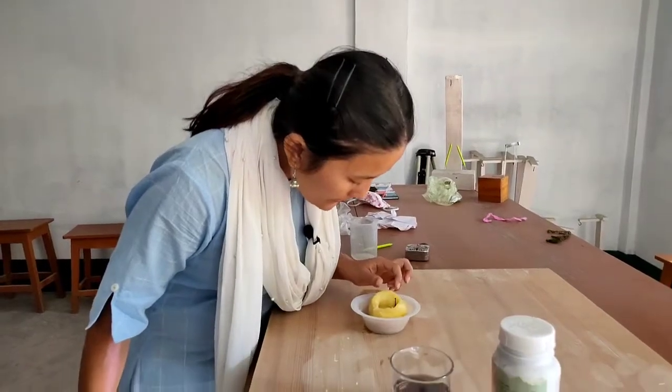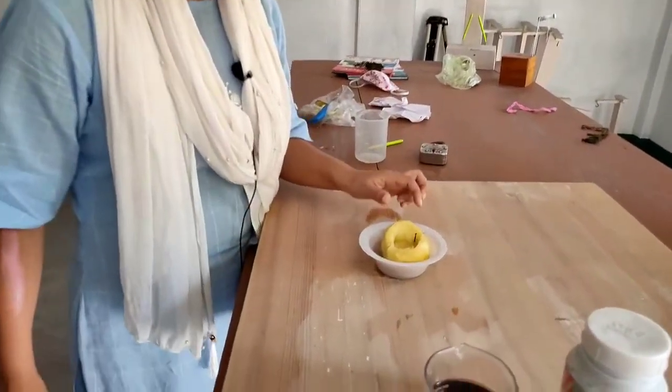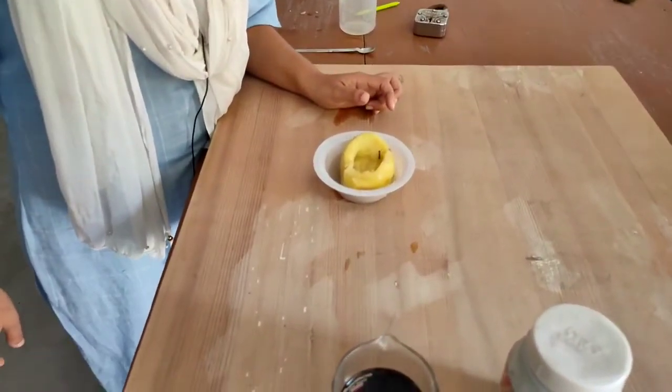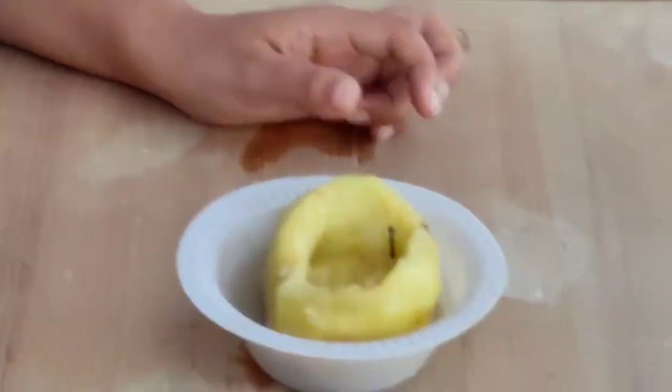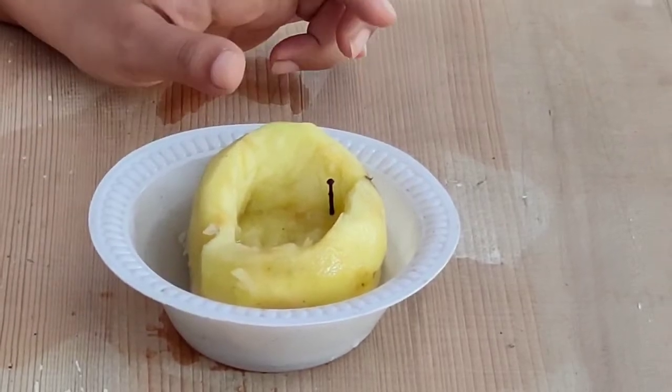Now after an hour we came back, and let's see. Now we can see that the pin is completely immersed in water. That means the water has moved from outside into the potato, thus proving our experiment that in osmosis, water always moves from higher concentration towards the lower concentration.